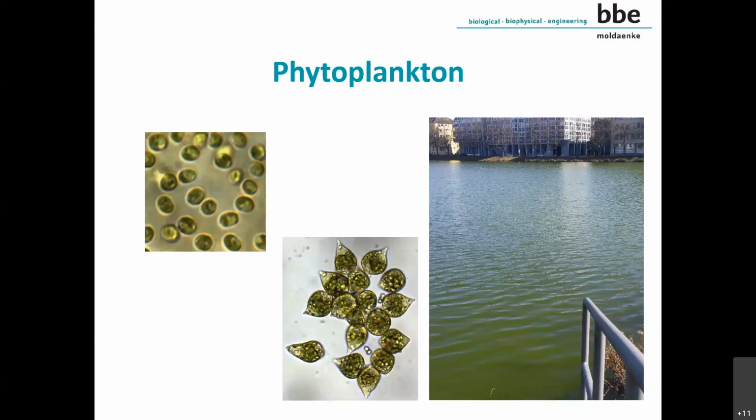That is algae, sometimes very small algae, and mostly diatoms. In this case, for example, we have green algae, golden algae, and dinoflagellates, and some other types that can be differentiated taxonomically. And we have another group which does not really belong to the algae, the cyanobacteria, but they have similar features so that we can focus on them. This is an important group or class of phytoplankton which has become more and more important in the past.